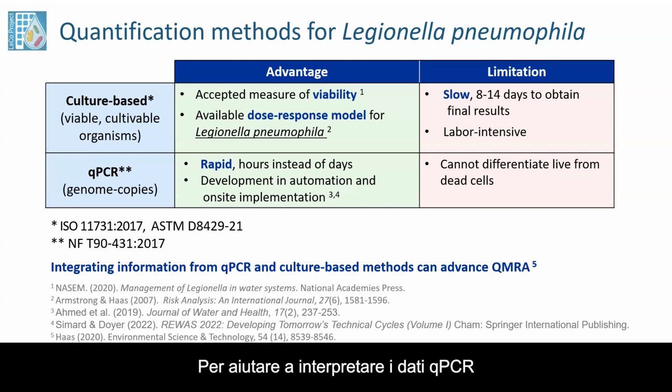To help interpret qPCR data in Legionella risk assessment, the key question we asked was, what is the relationship between results obtained with cultivation and qPCR methods? Let's now look at the factors that influence that relationship.